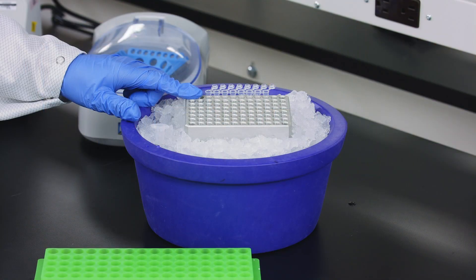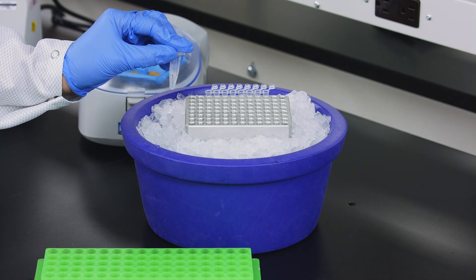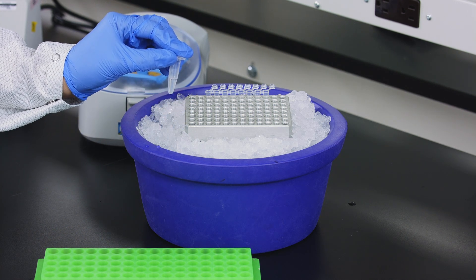We have our master mix aliquoted into a PCR strip tube and our single cell suspension sitting on ice. Now we are ready to combine our master mix with water and our single cell suspension.